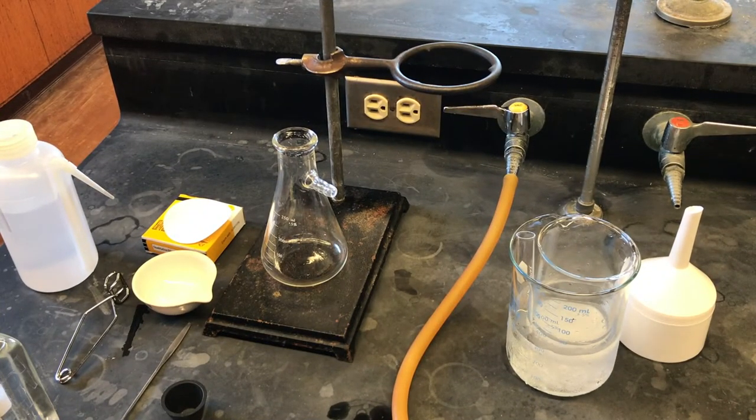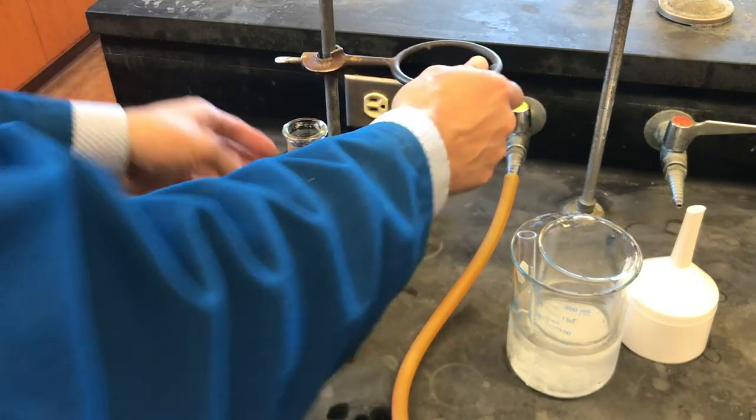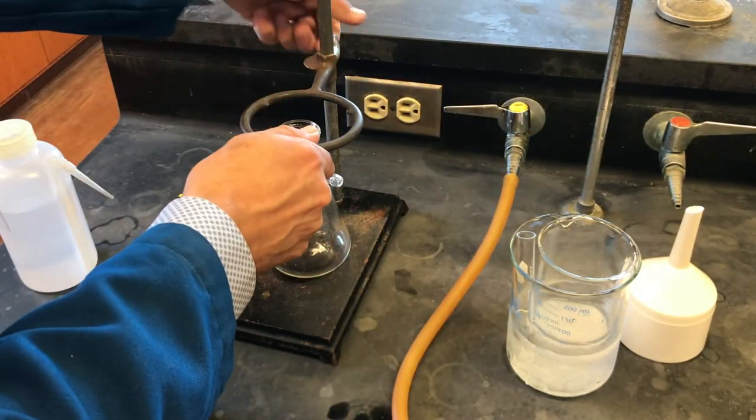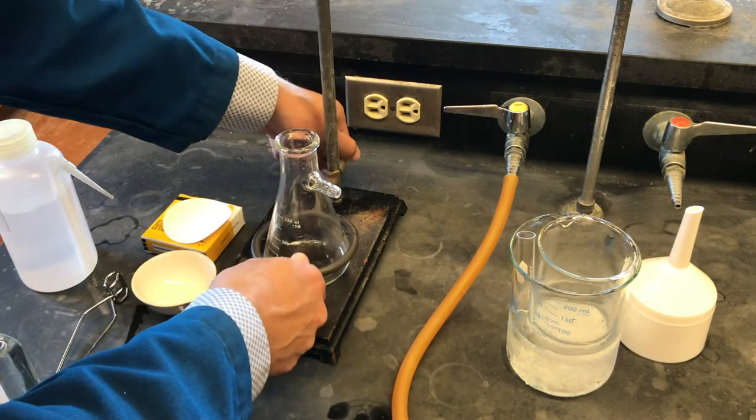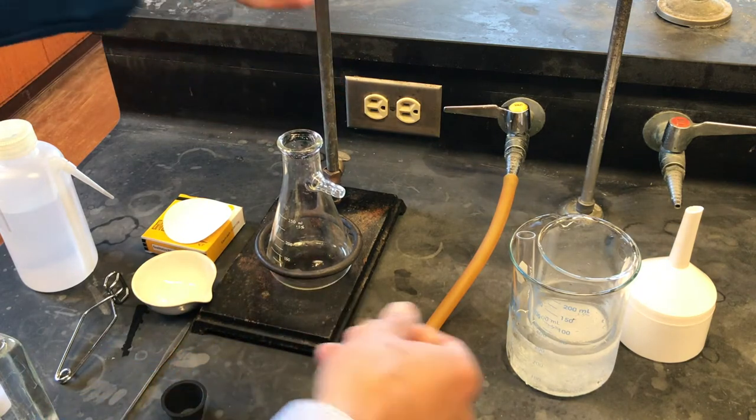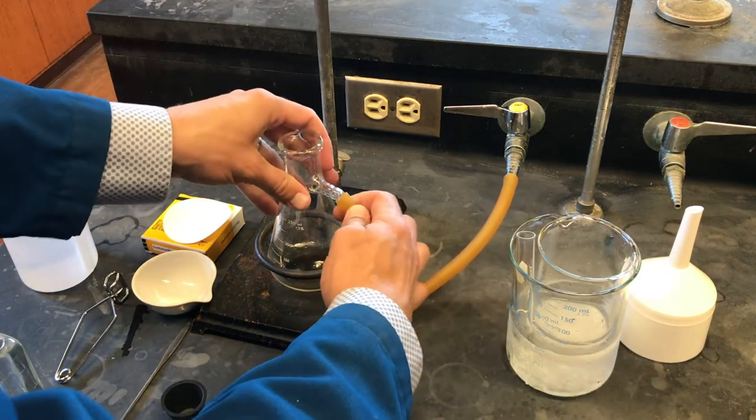We will again prepare our filtration setup using the Buchner funnel. It should be noted, in this filtration we will be saving the crystals on top of the filter paper, not the filtrate in the filter flask.